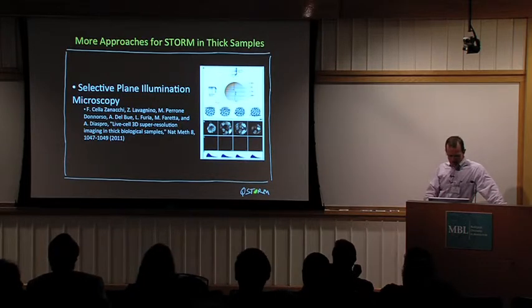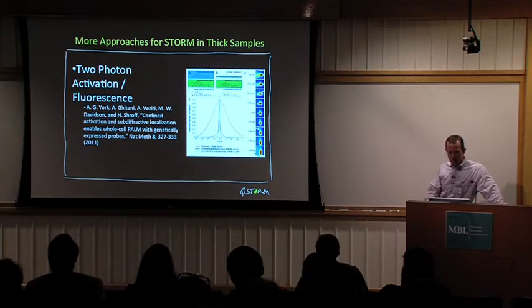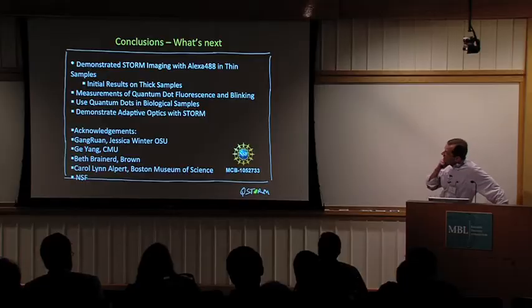So I think I'll just wrap up. There's some other work done on using STORM in thick samples using selective plane illumination microscopy and two-photon activation. These are complementary techniques that we can combine with the quantum dot approach that we're taking. So in conclusion, we've demonstrated that you can do STORM imaging.